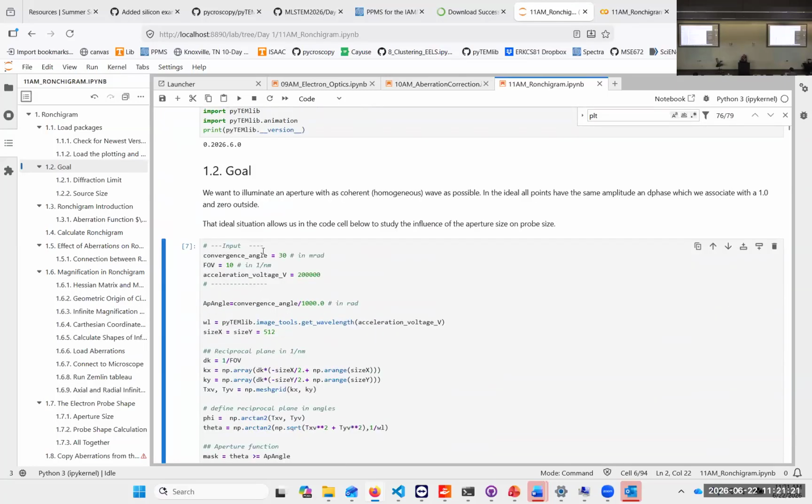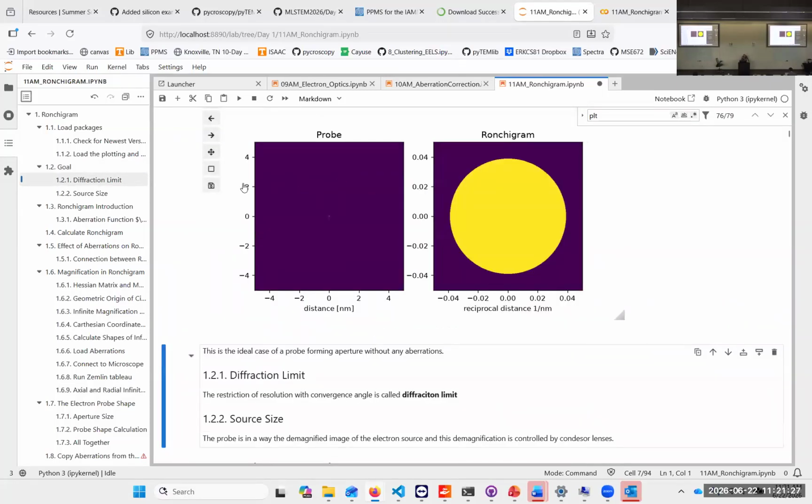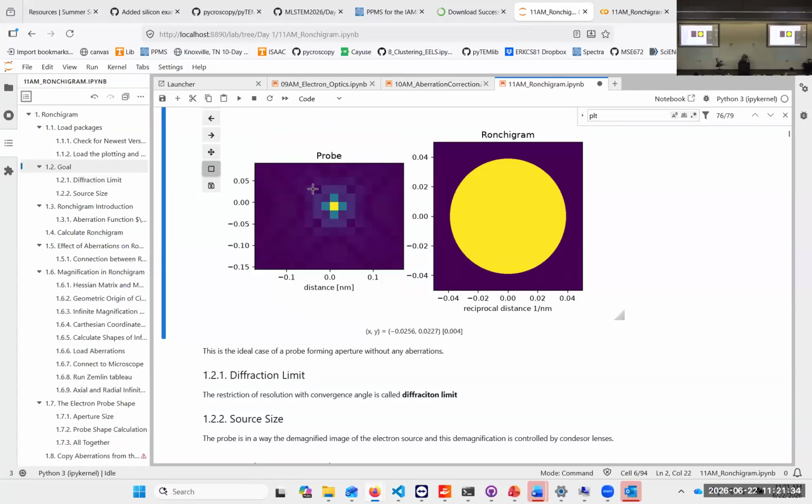And so we already are moving into the territory where it is pixelated by my Fourier resolution, so the resolution in Fourier space. And of course, because I know my 1/nanometer here, I know how big of a change I have here.